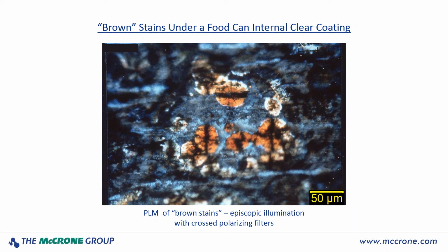That's a typical morphology of a starch grain. The black lines are known as isogyres. We found out later through some analysis, by isolating some of these things from that can, that the material was actually iron carbonate. It was caused by some corrosion of the base steel underneath the tin, oozing up into the surface of the metal and out underneath the clear coating to produce these features.